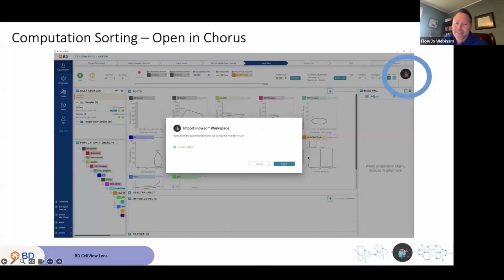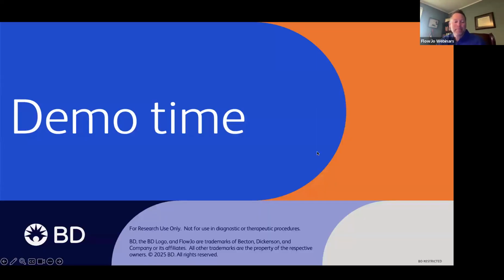Ah, yes, sorry. There was one more animation. There's an import button. All right, and now it is done.